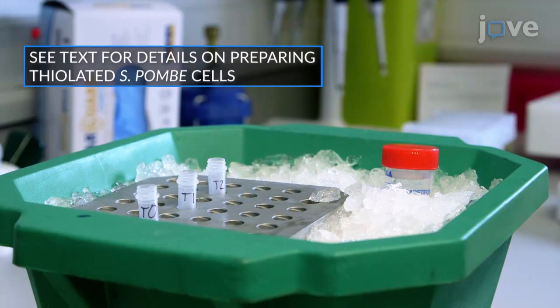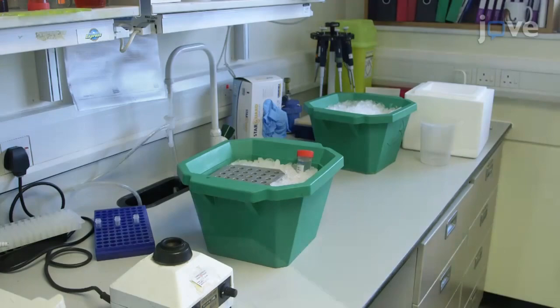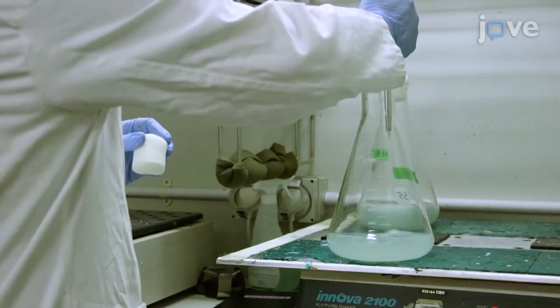If an S. pombe spike is to be added to the culture, place an aliquot of thiolated S. pombe cells on ice to thaw. Vortex the thawed aliquot and add it to the culture.